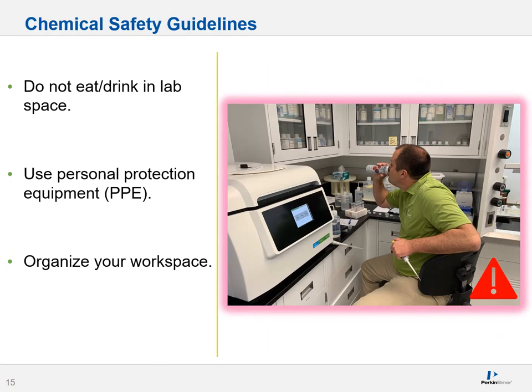A couple of chemical safety guidelines: do not eat or drink in lab space. All it takes is sometimes a drop of a lethal chemical to fall in your water or coffee, and perhaps it doesn't manifest right away — it manifests years later. Please use personal protective equipment, also known as PPE. Finally, organize your workspace. There are pipette tips exposed and lots of things to jab yourself or spill on yourself. Organization is key, especially when working with anything toxic or biologically hazardous, so your workplace is laid out clearly so you're not knocking over dangerous items.